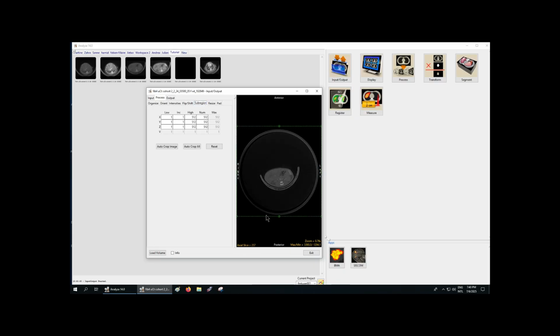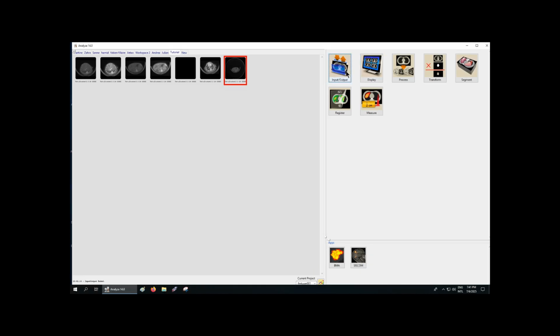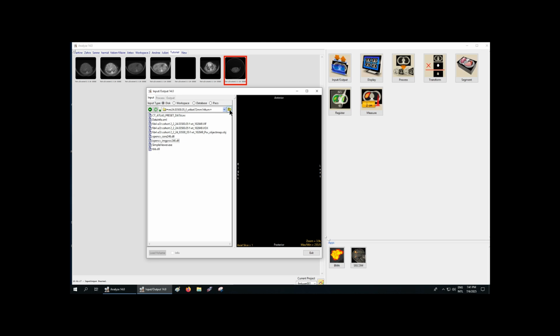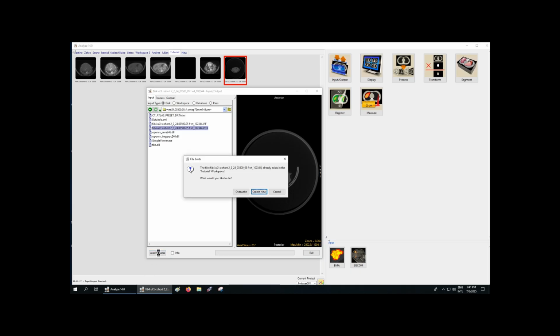I won't be subregioning this. Create new. There we go. Start on load mode. Calculate it. Load. Create new.